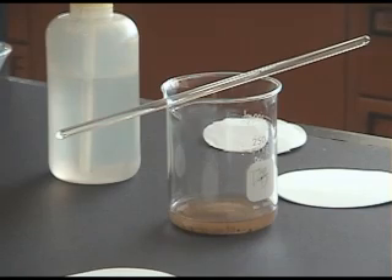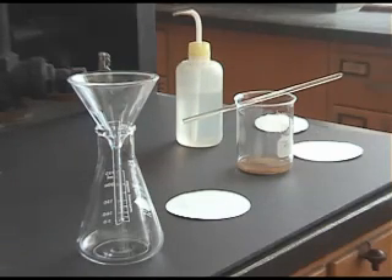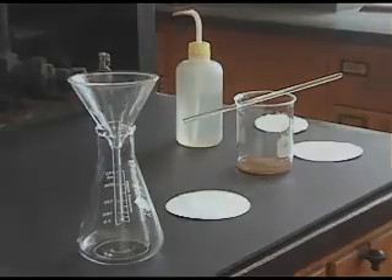Gravity filtration is a slow process, used primarily when time is not critical, or vacuum filtration is not practical. A gravity filtration setup includes a glass funnel, an Erlenmeyer flask, and pre-weighed filter paper.